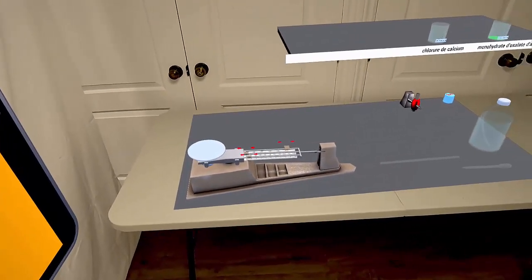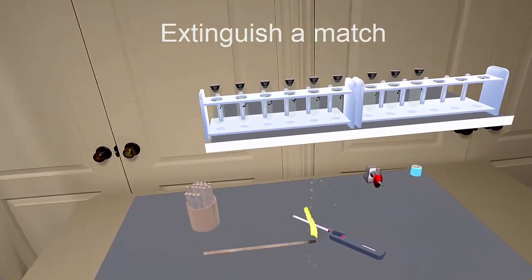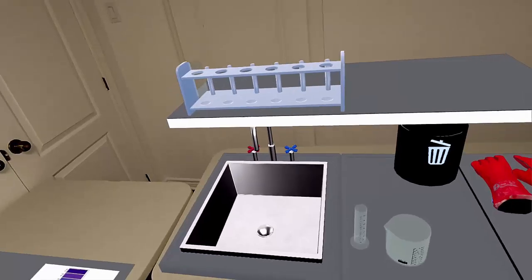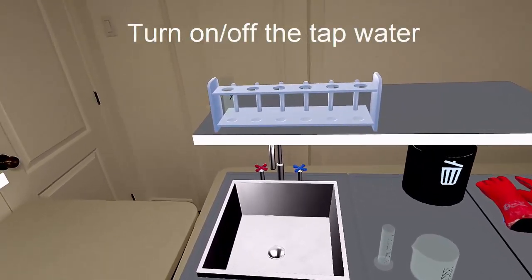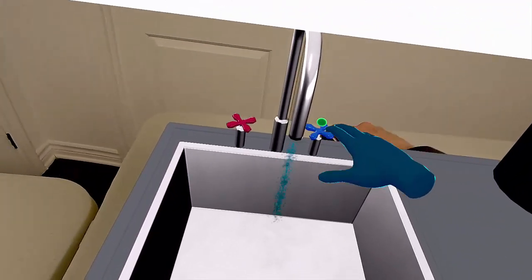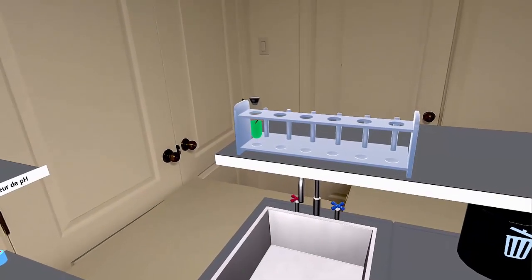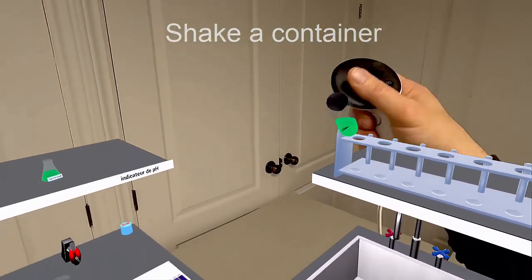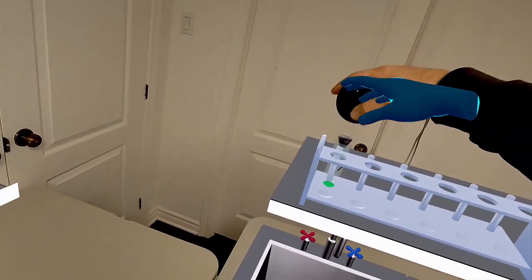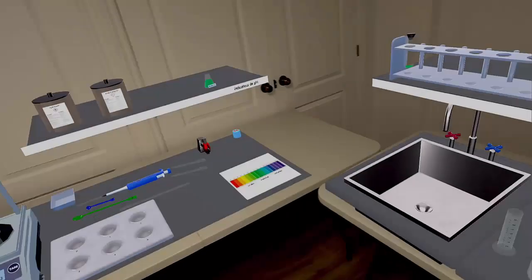There are several other types of manipulations you can perform intuitively. For example, if you want to extinguish a match, shake it as you would in the real world. If you want to turn on the tap water, press with the virtual hand on the hot water handle, or the cold water handle to open and close the faucet. If you need to shake a container, grab it with the controller and shake it. For certain containers, like test tubes and Erlenmeyer flasks, a stopper must be in place before you can shake them.